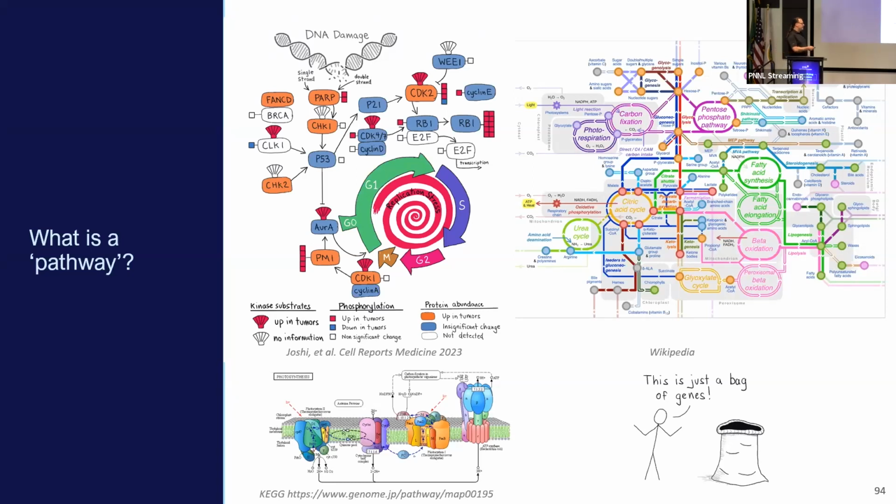And so the last one I wanted to throw in here, because some of the databases that I'll talk about in the next slide have other things, bag of genes that kind of does the same thing. Stress response is a great example. So as stress response pathway, you can imagine that there are stress response pathways that look a lot like this.